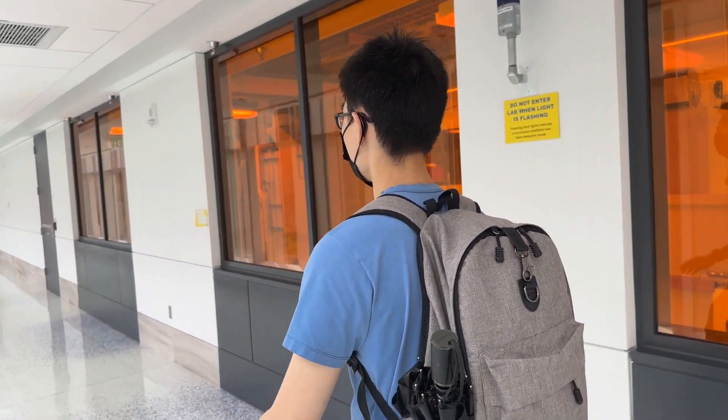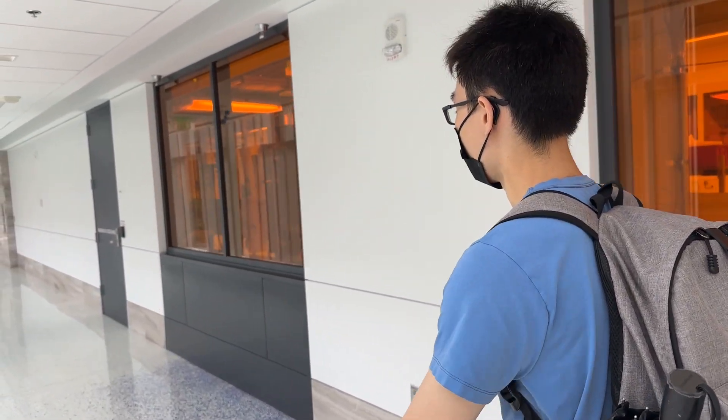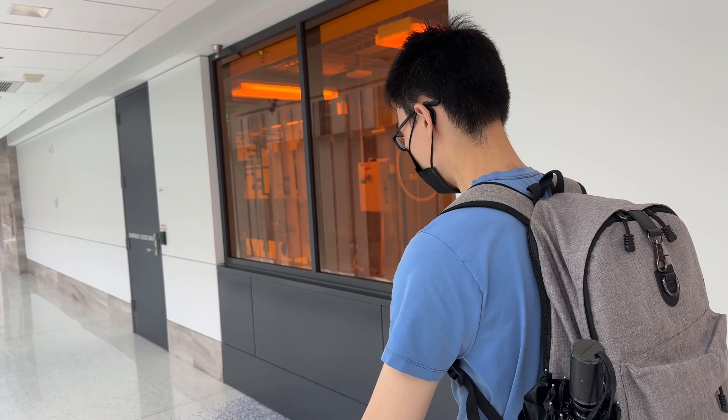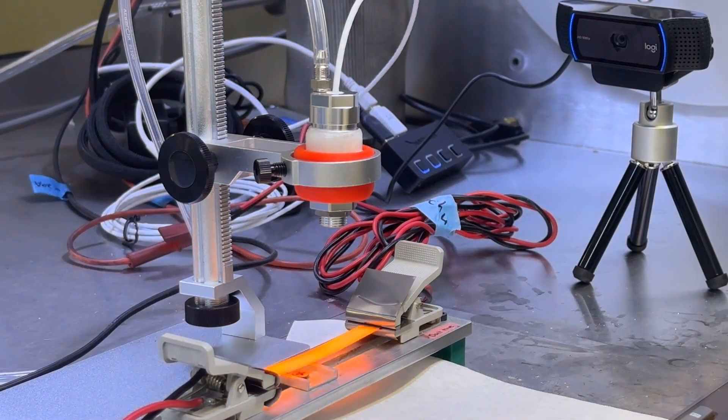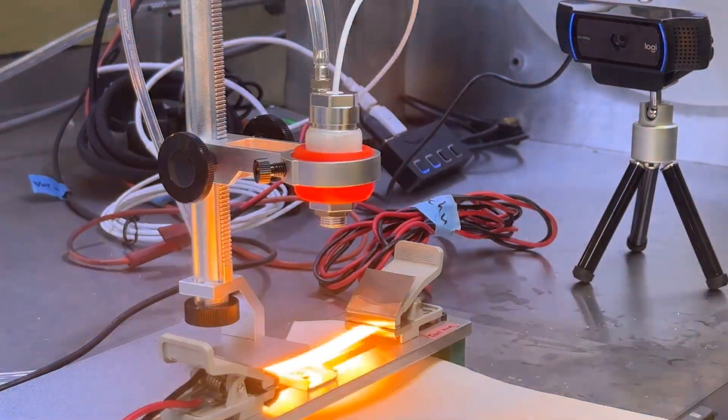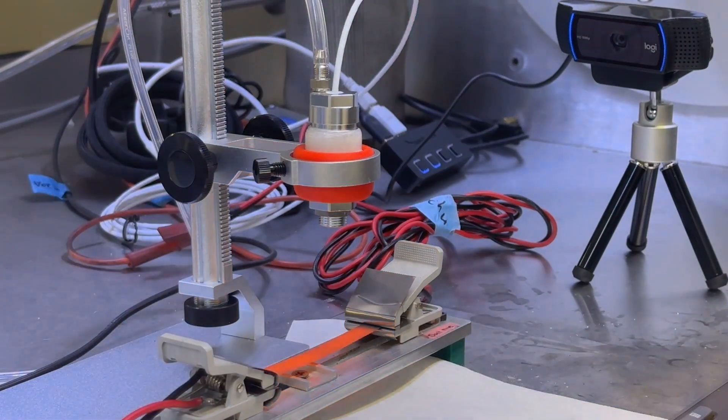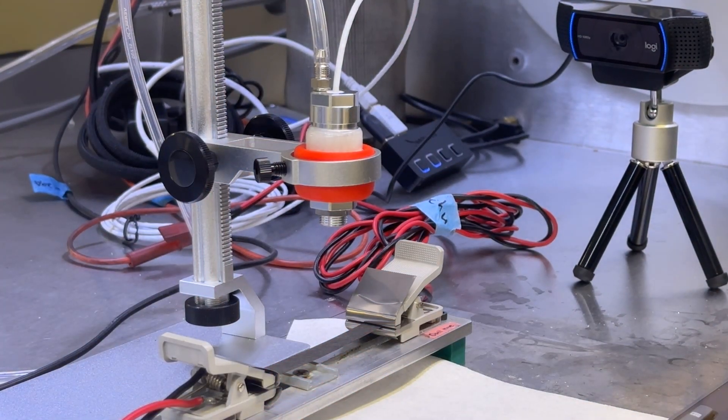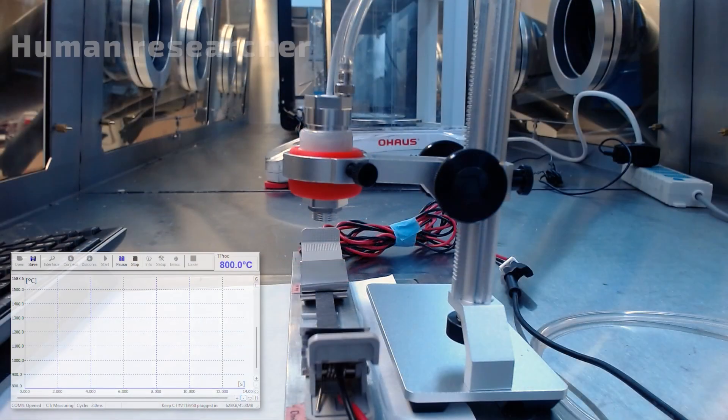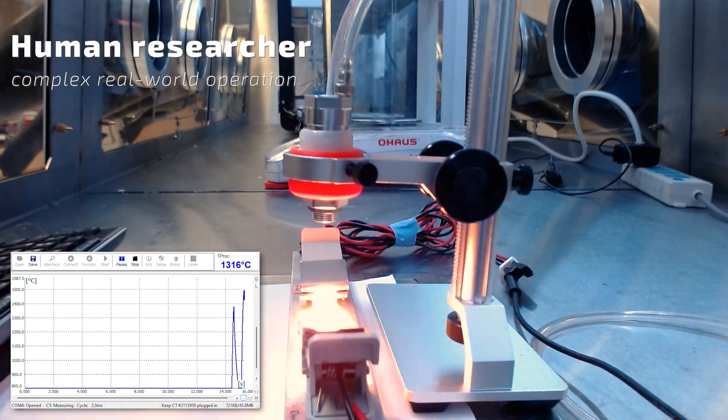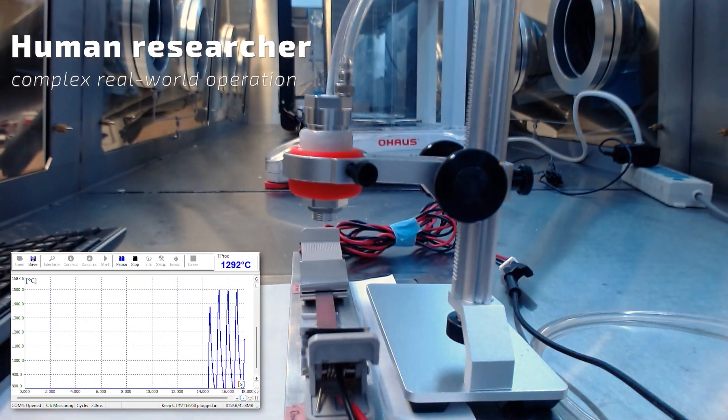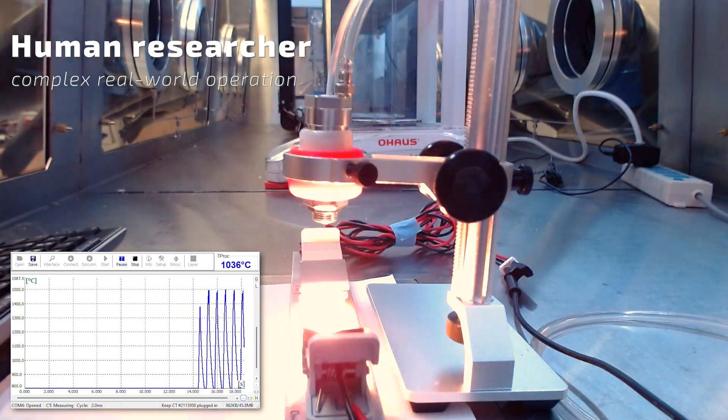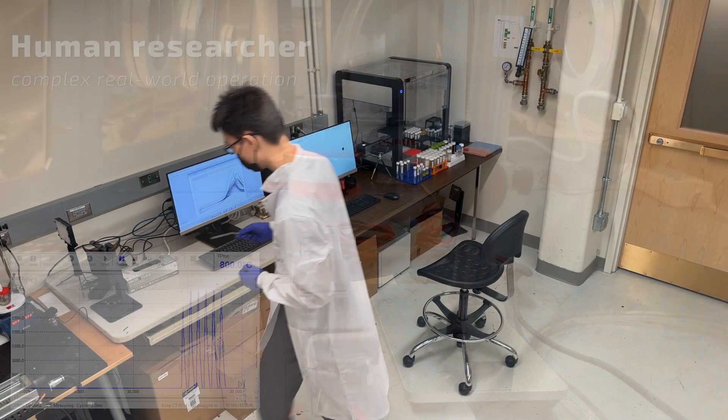Thank you for preparing the samples. Looks pretty good. I'm heading back now. We'll work on carbothermal shock soon. You're welcome. That's great to hear. Take your time and let me know if you need any assistance with the carbothermal shock process. That's my job. Currently, you cannot help with it. I'll let you know when I finish.